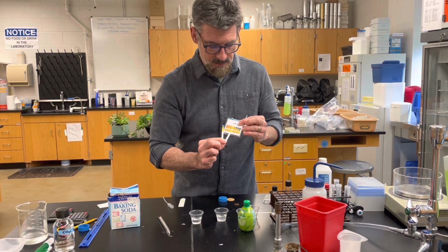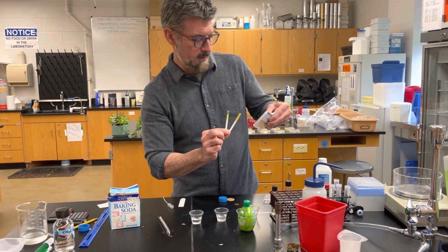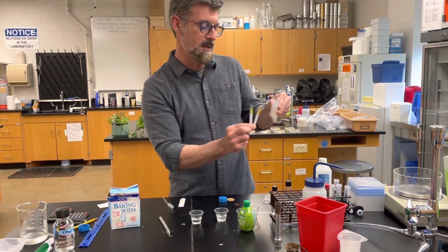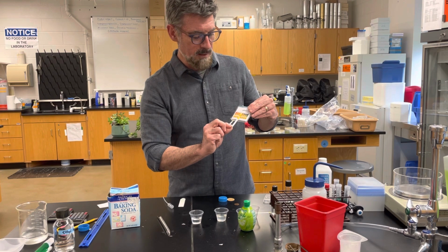You can see here, it's not actually lining up well with any of those. It's definitely on the lower end, because this top one would be darker. You can see it just keeps getting darker. So it's definitely something down here on the bottom end, probably somewhere around the 2-3 mark.